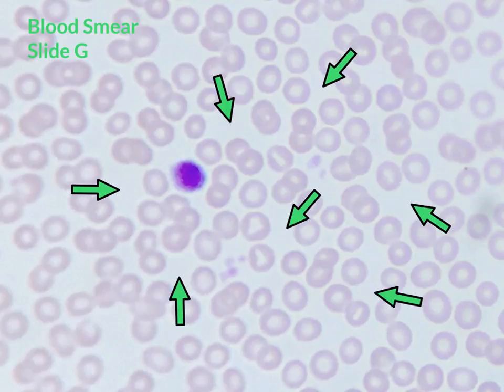Also shown here is the space between the cells. This space is filled with fluid called plasma.